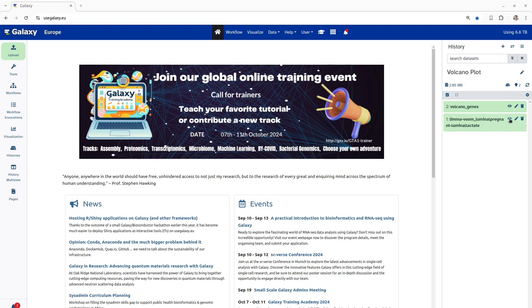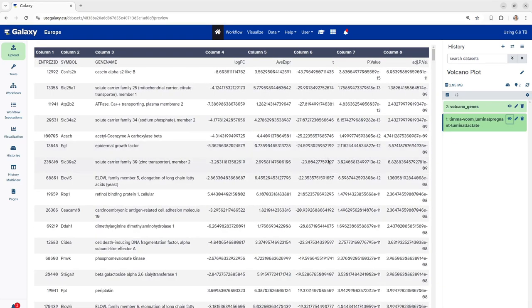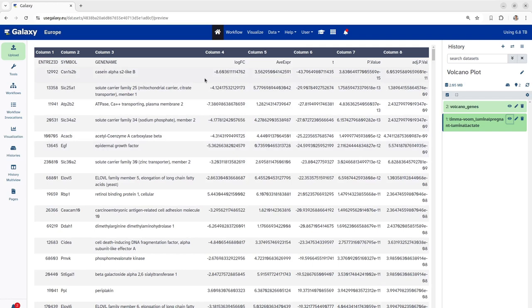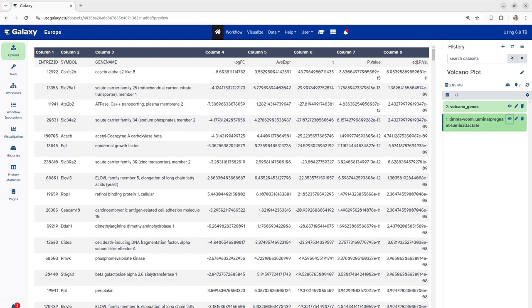Let's first go to the limma voom file generated from the limma voom pipeline. In this, we can see we have the required columns: the gene names, the log fold change, average gene expression, p-value and adjusted p-value. That means the file is perfect to proceed with visualization on a volcano plot.